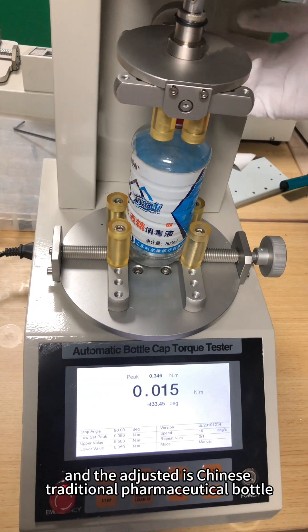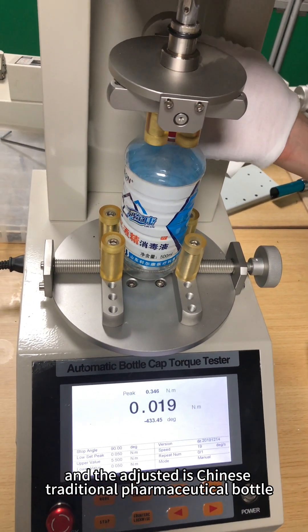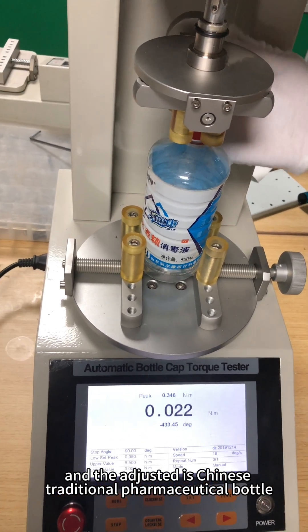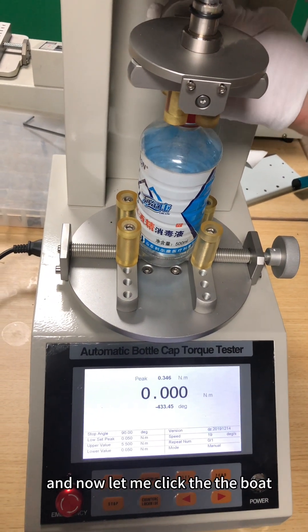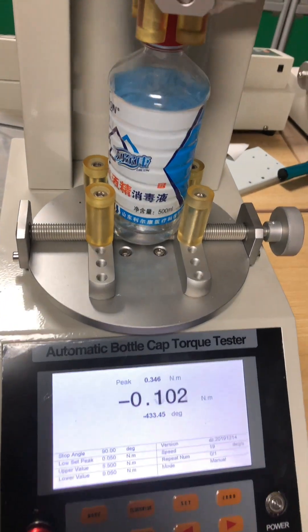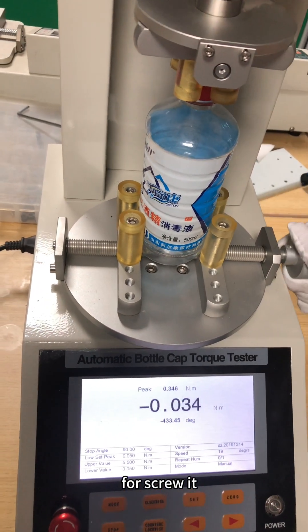The objective is a Chinese traditional pharmaceutical bottle. Now let me click the bolt for screwing — screw it.